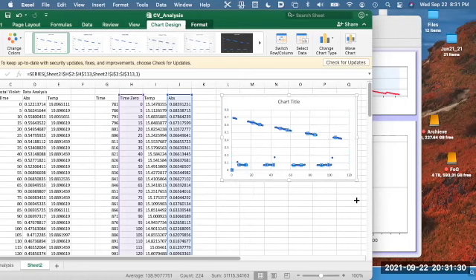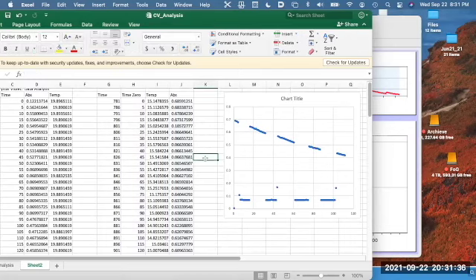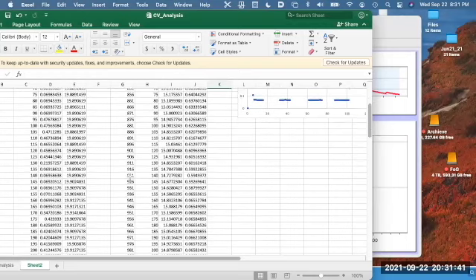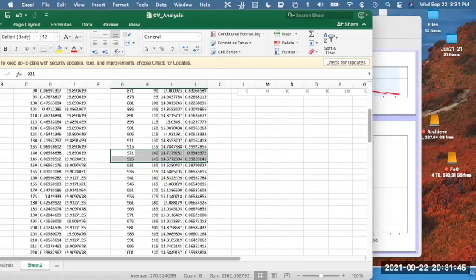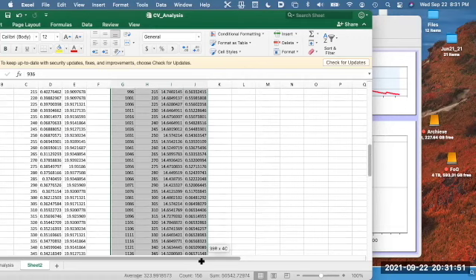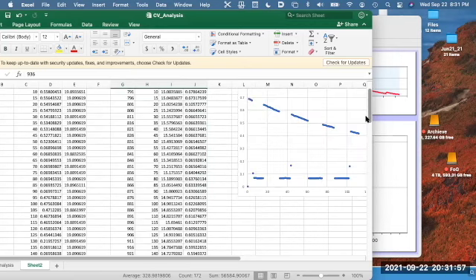Then what I want to do is look for the data in which the absorbance drops to nearly 0, and I can do that by just looking at the data set, and wherever I can see that it drops from, like in this particular case, 0.599 to 0.06, I know that the 0.06 is where the absorbance drop.